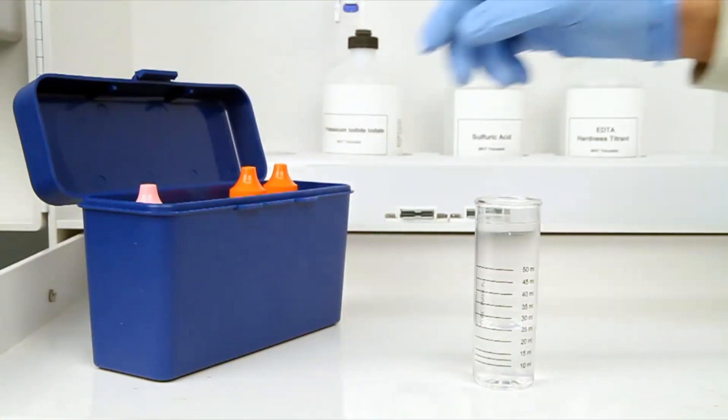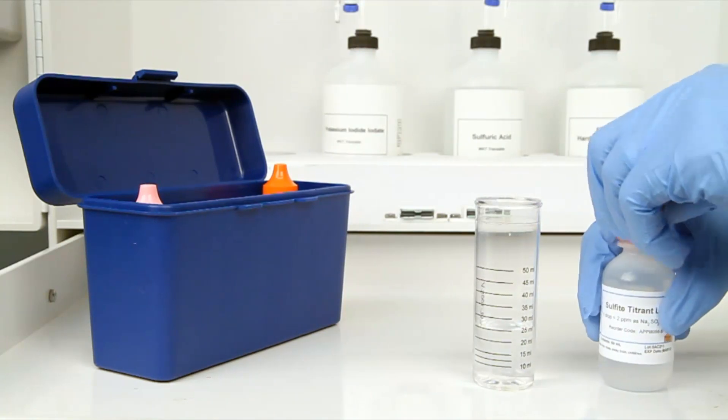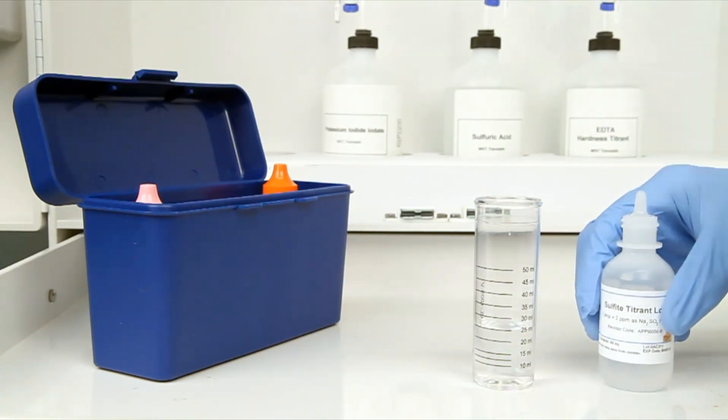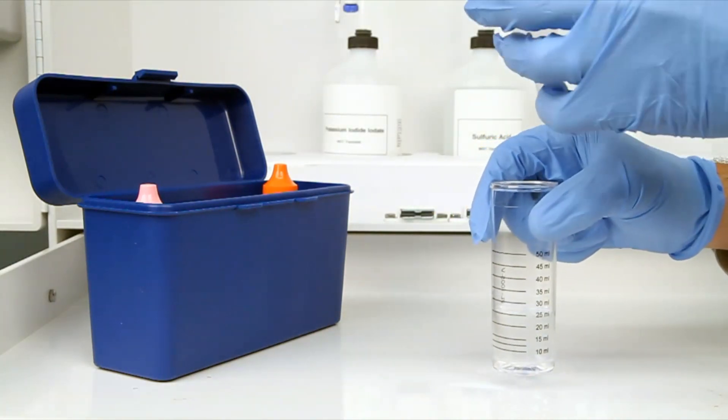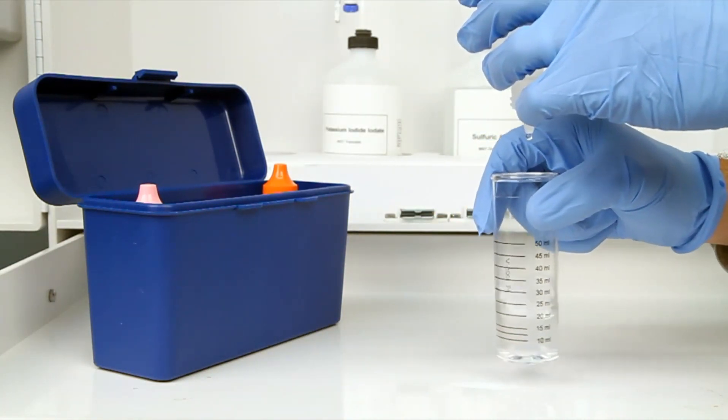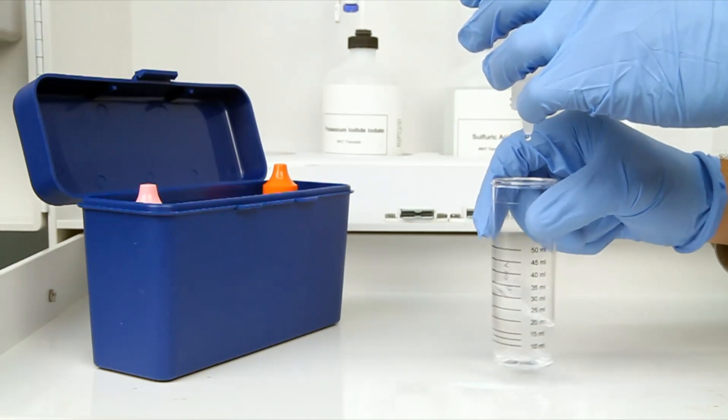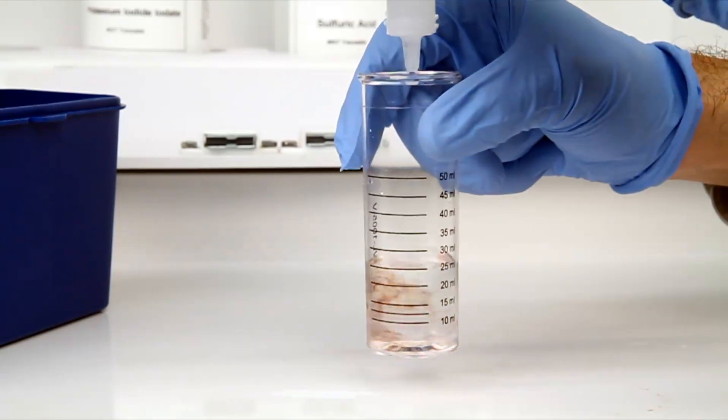The next step according to the endpoint ID procedure is to perform the titration. The bottle of titrant contains a dropper tip, therefore it's important to hold the bottle vertically to make sure you get a consistent drop size. After the addition of each drop of titrant, you want to swirl the vial to make sure the sample is properly mixed.